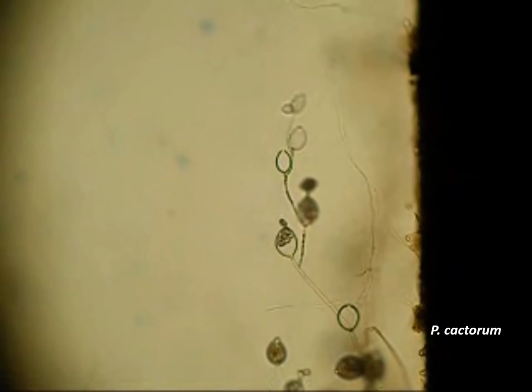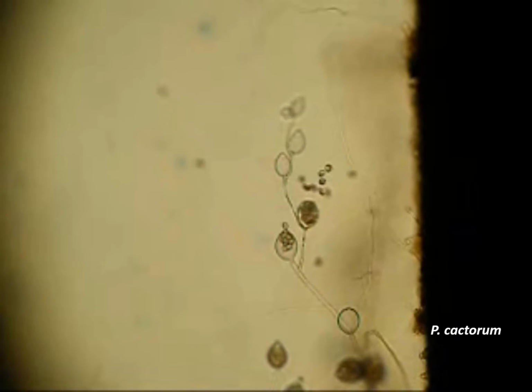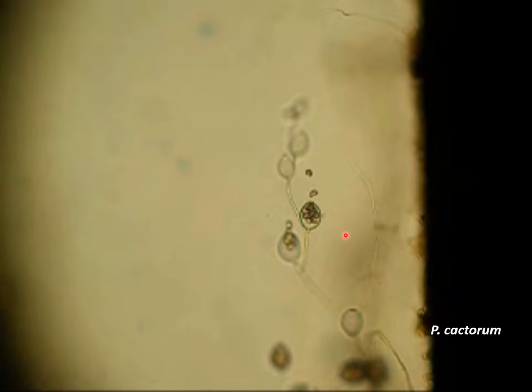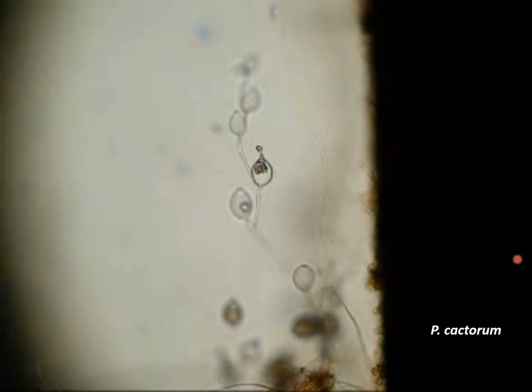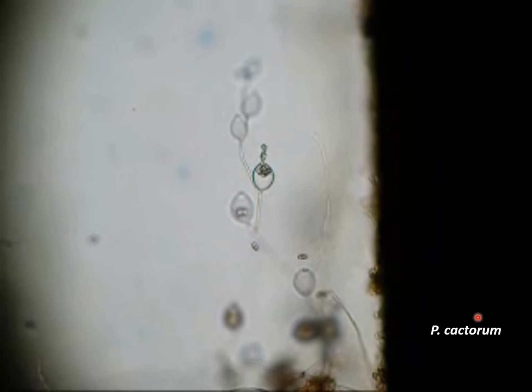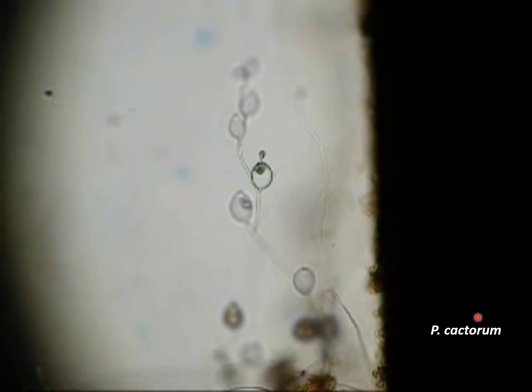This bit of video shows zoospore release occurring from sporangia of Phytophthora cactorum. You can see this sporangium here and this one are both releasing in a little bit of a slow fashion. The zoospores have differentiated inside of the sporangia and are then swimming out intact. See another one releasing more rapidly down in this area. These zoospores now are swimming off in search of host tissues to which they're attracted by chemical signals.